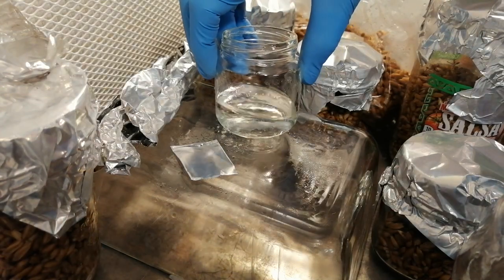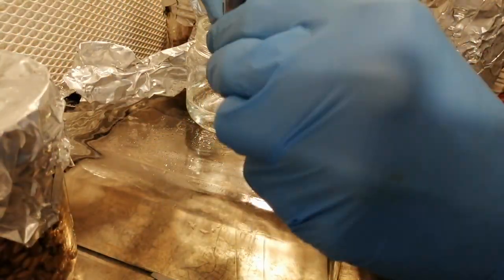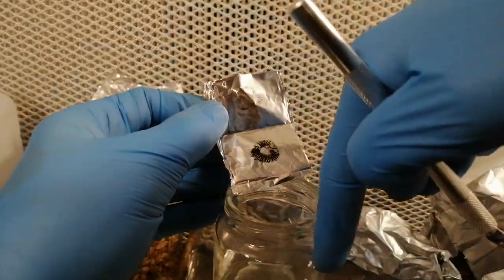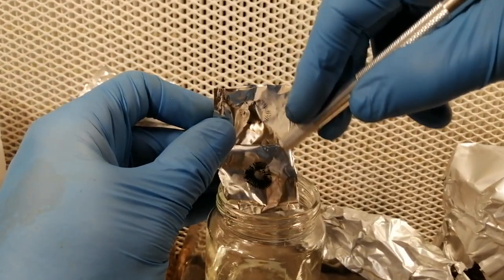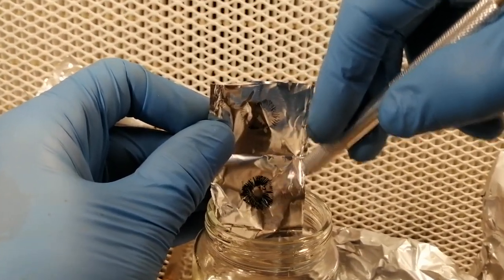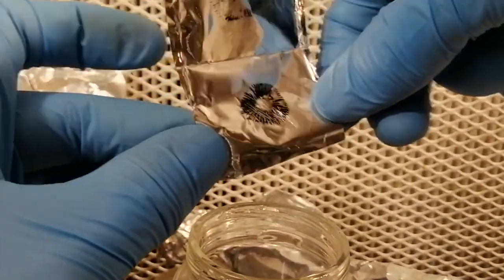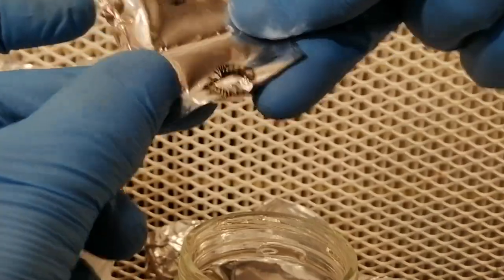10 cc's of spore water is enough to inoculate about 6 jars of grain. Even a small print can be used to make 20 cc's of spore water — there will be hundreds of thousands of spores even in a small print. A large print could be used to make dozens of spore syringes. Carefully unwrap or open up your spore print. Using your sterile knife or razor, scrape the spores directly into your sterile water. Some people prefer to scrape the spores into a shot glass and then add water after the fact, which can reduce the amount of time the water is exposed to the air. But I haven't had any contamination issues going direct to the water, and using only one container may be less prone to contamination than using two or more.